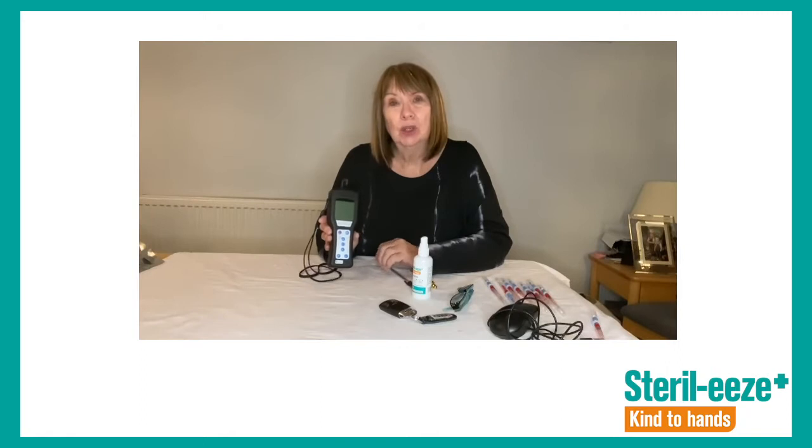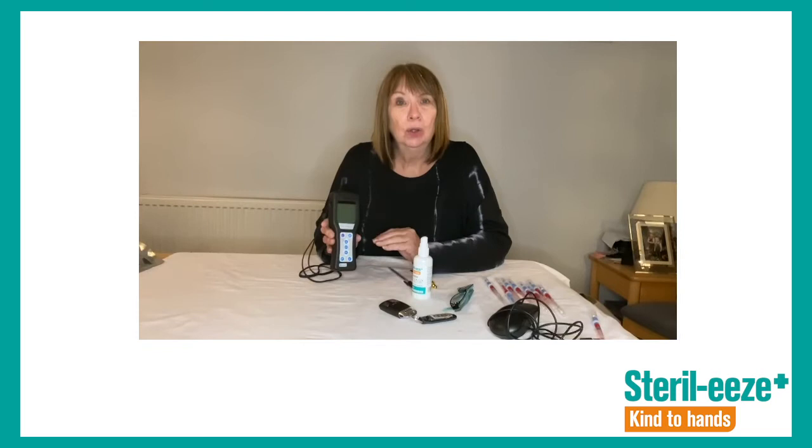We use this machine to screen surfaces in a whole range of industries, but specifically the food industry, and also infection control when we're trying to swab if the surface is clean. Very, very simple to do, a very rapid technique, not always better than actually looking for microorganisms themselves, but a very good alternative.